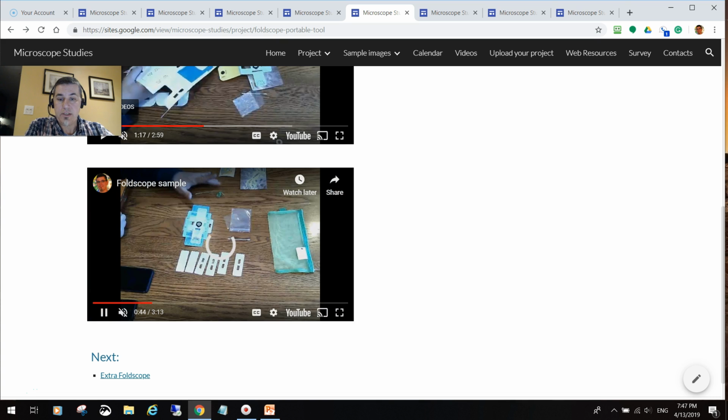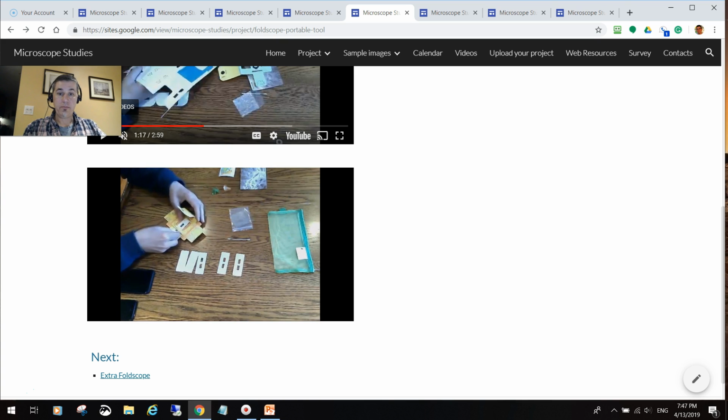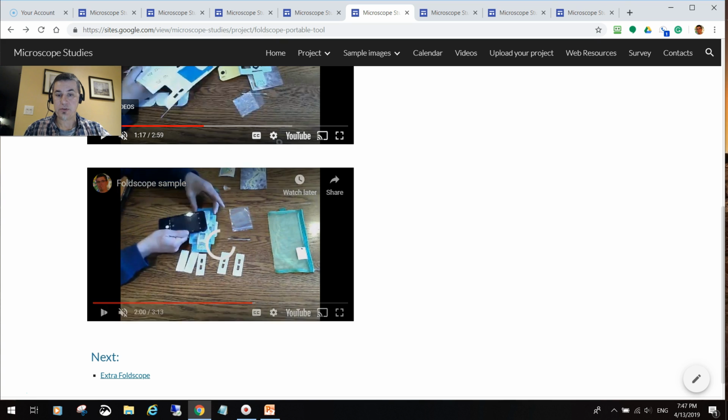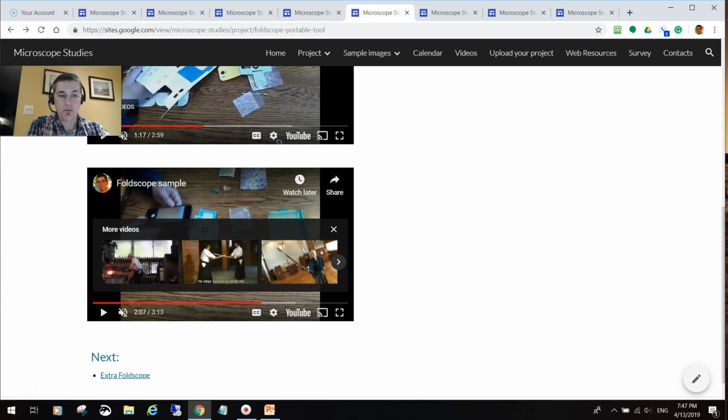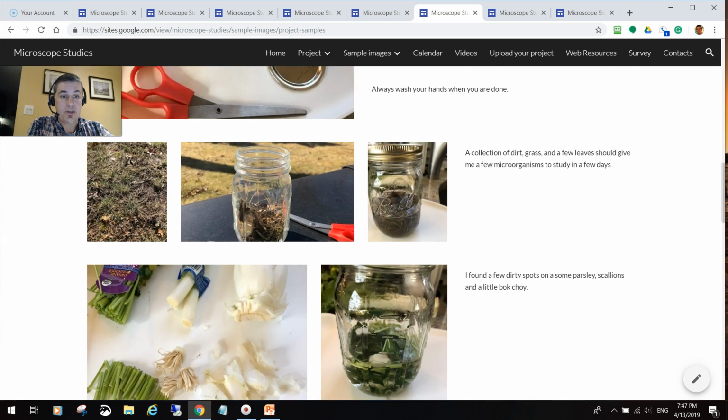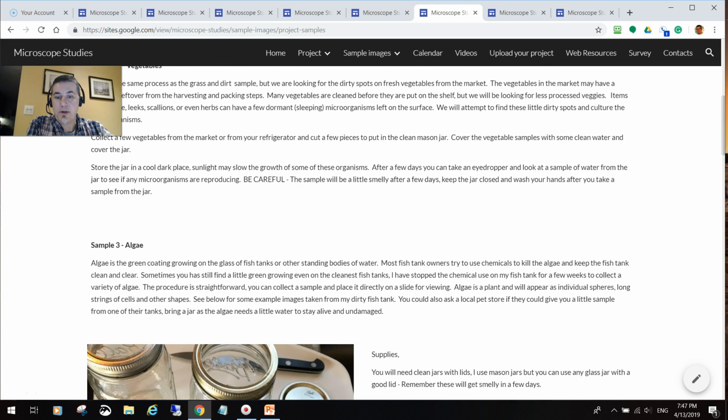They could take these pieces of paper and put tape on them, collect whatever they want, stick it on there, and the magnets held everything in place. And then taking images with the camera in your phone was all done through that little pinhole. And it's a single lens microscope, which is one of the fundamental microscopes that were invented back when microscopes were first discovered.